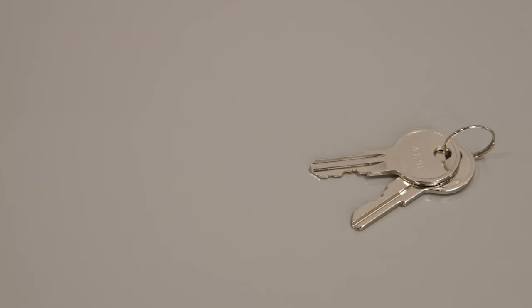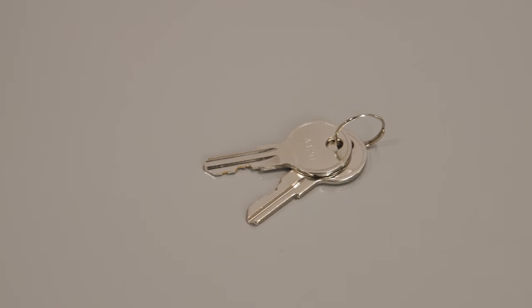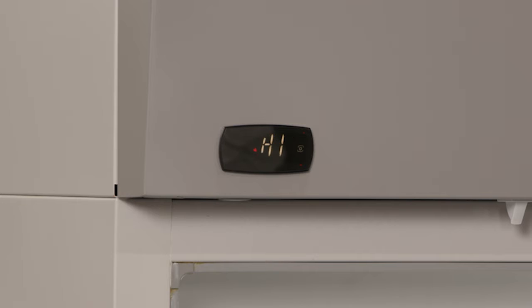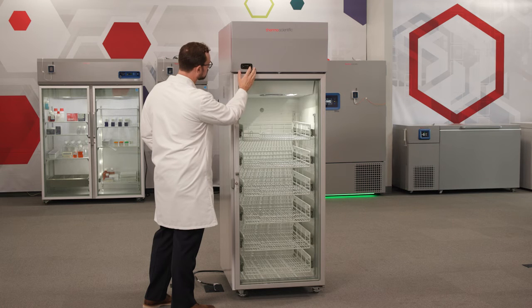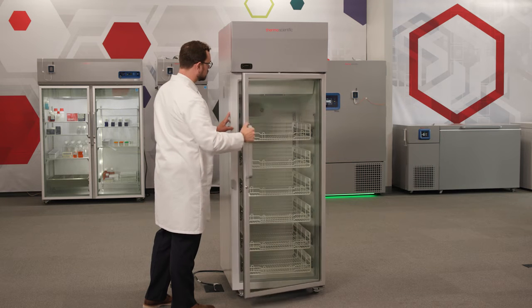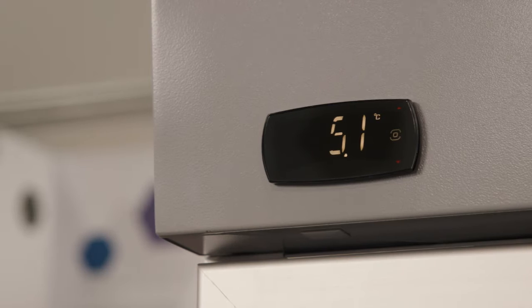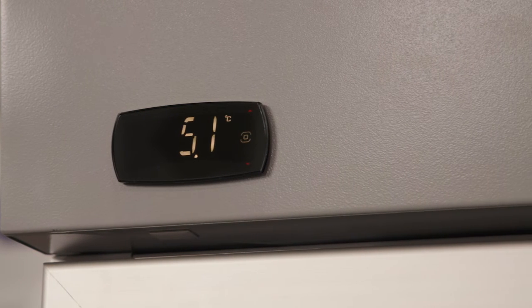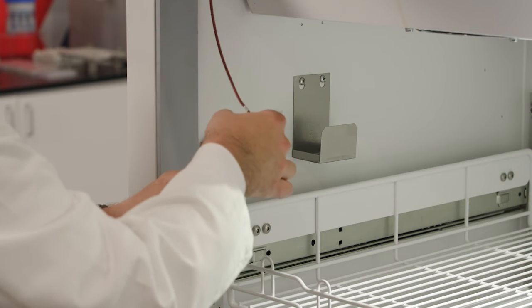Place duplicate copies of the key in a safe and accessible place. Verify that the controls are fully operational, the alarm is active, and that all of the LED lights and visual indicators are working. During normal operation, the display shows the internal temperature in degrees Celsius, which is measured by the primary sensor.